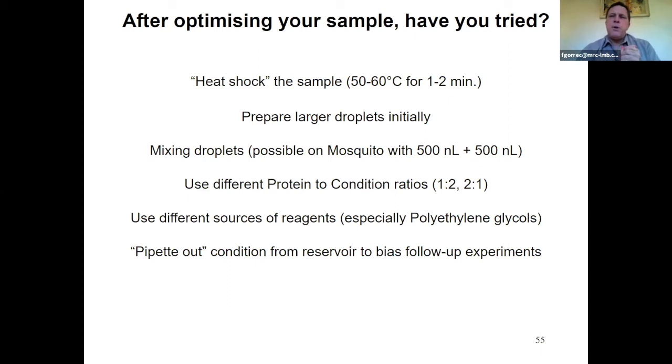If you remember the slide with the phase diagram droplets, where you see precipitate and microcrystals, that could be a sign that you had diffusion in the drops before or during the vapor diffusion. This is nice because it triggered crystals, but it also means it will be harder to be in control there.